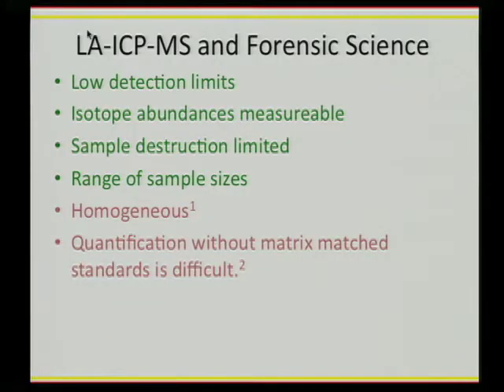Some of the caveats of ICP are that your sample must be homogeneous, because if it's inhomogeneous, you don't want to be sampling the entire sample, just to get good statistics or a good representative spectrum from your sample. Also, quantification without matrix matched standards is difficult, but recently we have been looking at using piezoelectric balances to overcome this caveat.